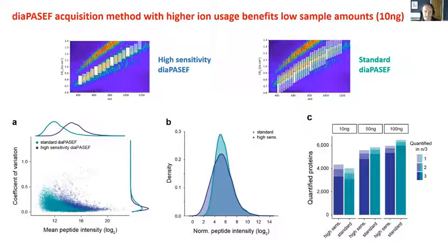So the maintenance, the cleaning, is surprisingly little, and I don't know why that is. It could be either to do with the fact that we are loading less material, right? We're only ever loading a couple of 100 nanograms, or it could be to do with the fact that maybe the mobility cell is kind of protecting the rest of the instrument to some extent. But the only routine cleaning that we do is of this glass transfer capillary. In between the spray and the mobility cell is a dielectric glass capillary. And this we clean around every 2 to 3 months, which does require a vent. But we don't clean anything else.